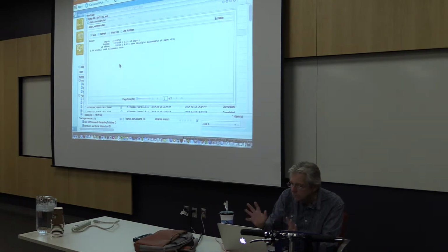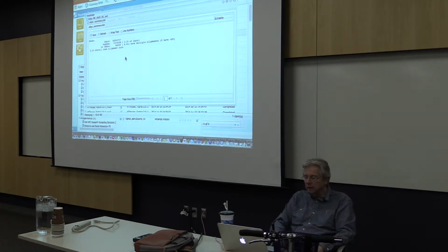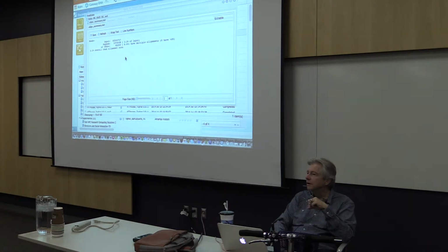Now this is not, again, related to what we're doing today, but this is an example. You have these many input reads, these many maps. Look at that, only 3.3% of the input reads map. I was probably screwing around and mapping it to human or something, I don't know.